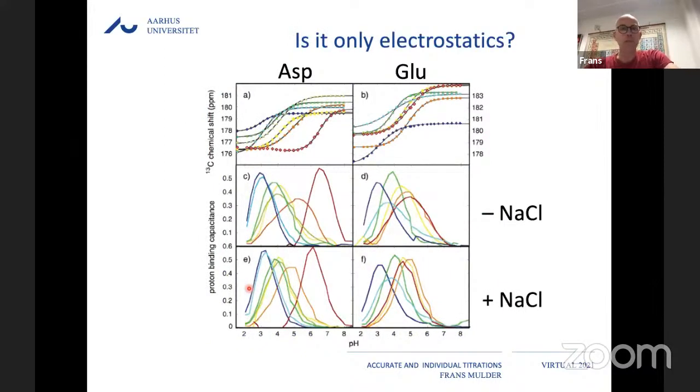They're really changing. So one thing that we then did is obviously the experiment with removing the salt or adding the salt to see if one can screen out these electrostatic interactions. If you look at the derivatives, I think it's pretty easy to see that these curves do all move closer to the model pKa value, and they also increase their amplitude. So very clearly, charge-charge interactions play a role in both the magnitude of the pKa shift and the asymmetry of the behavior here.